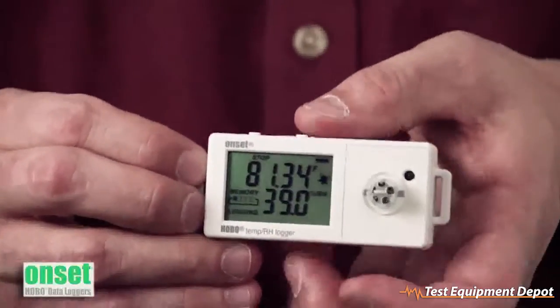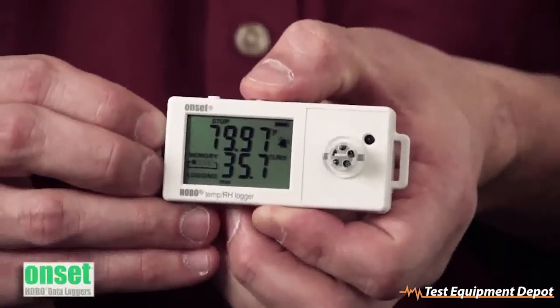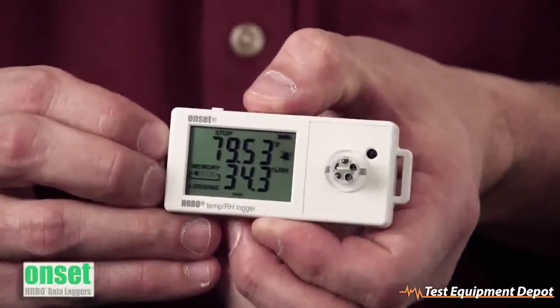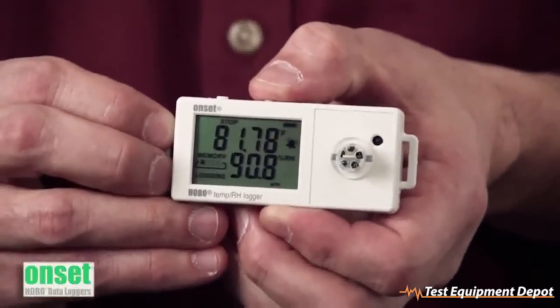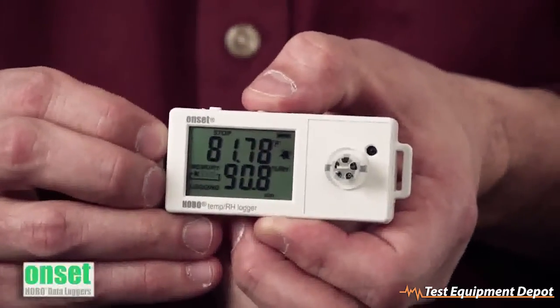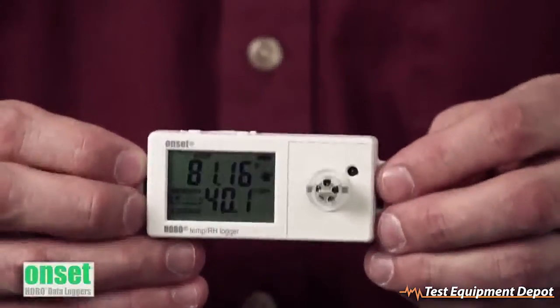The right push button here allows you to scroll through the different settings. By pushing it once, you'll see your maximum, minimum, average, standard deviation, and then the highest alarm threshold that the logger recorded, and finally back to the original readings.